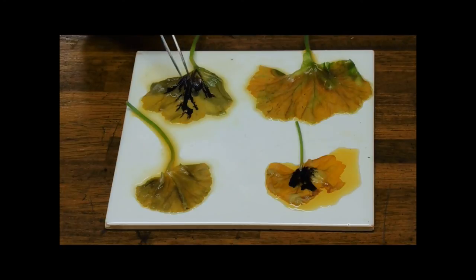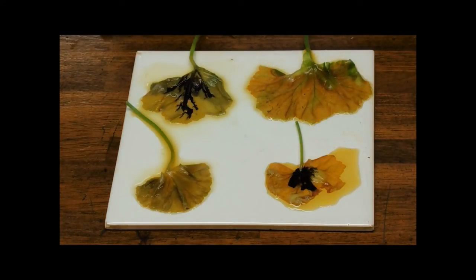And here, where we have that lovely star shape cut out. And you can see that we've got little bits around the leaf veins. I think that's probably sucrose being transported out to the leaf margins and then being converted back into starch, perhaps. But most of it is down here where that star shape was cut out of the foil.